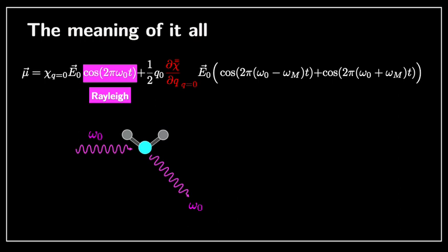We aren't going to worry about this one. This is the Rayleigh light. This is essentially a response of the material that's basically no response. The frequency that is impinging is the same frequency that comes out. We do not get much information from the Rayleigh light in Raman. In fact, we don't get any. In fact, it's usually the largest proportion of the scattering through the Rayleigh line, and it's usually a pretty large signal that we mostly try to get rid of. But let's look at the other two.